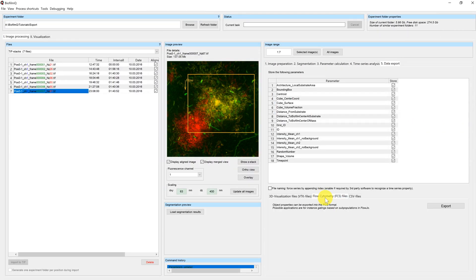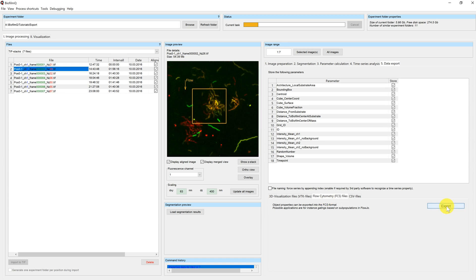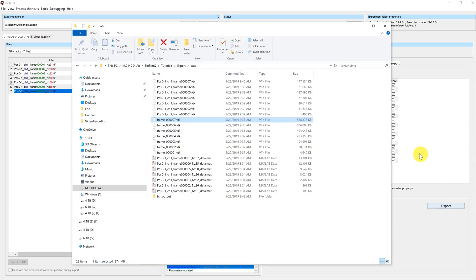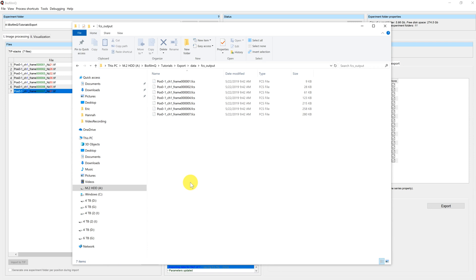If you want to export your dataset to a flow cytometry software, for example FlowJo, you can use the FCS file format. You just have to press export in the flow cytometry tab and a new output folder will be created called 'FCS output,' where you can find all the exported files.